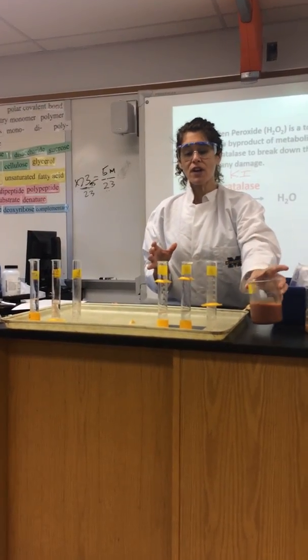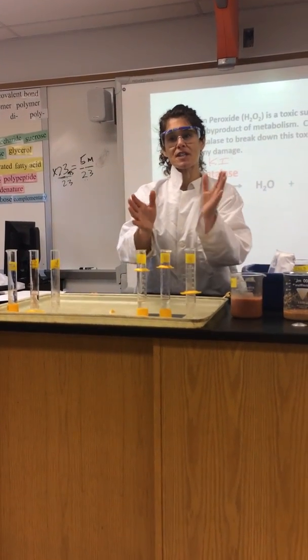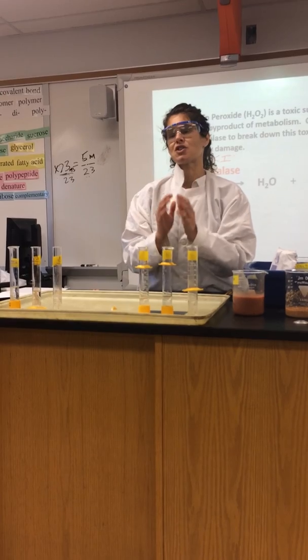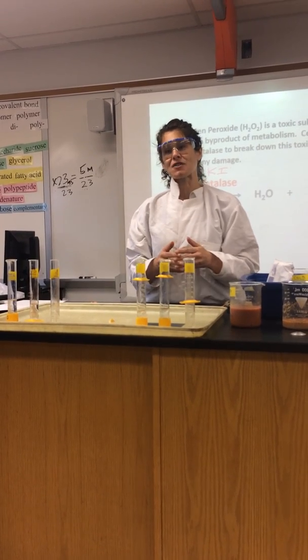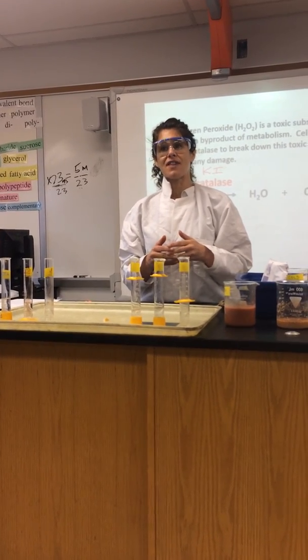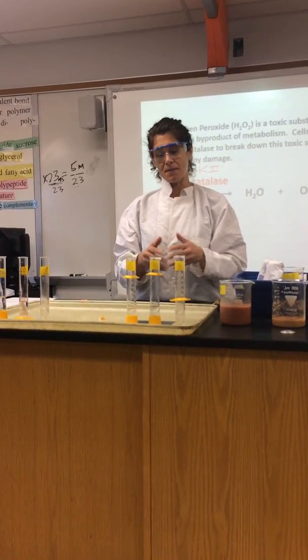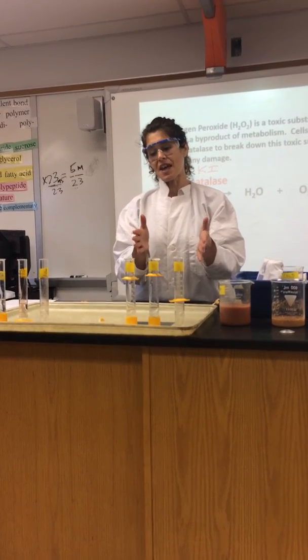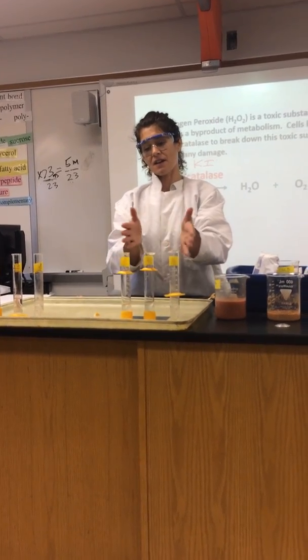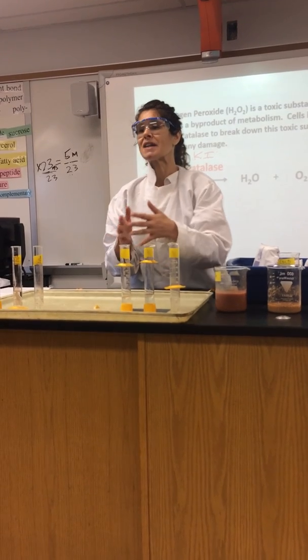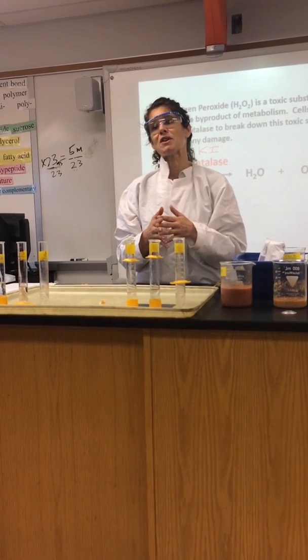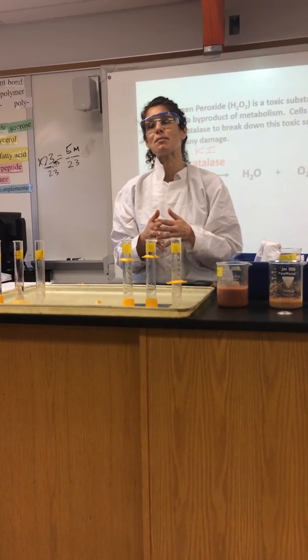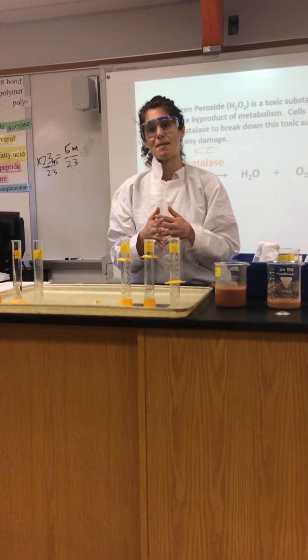We are going to do two separate experiments to show different factors that affect the rate of enzyme activity. The first set of graduated cylinders we're going to be using to test how temperature affects enzyme activity.